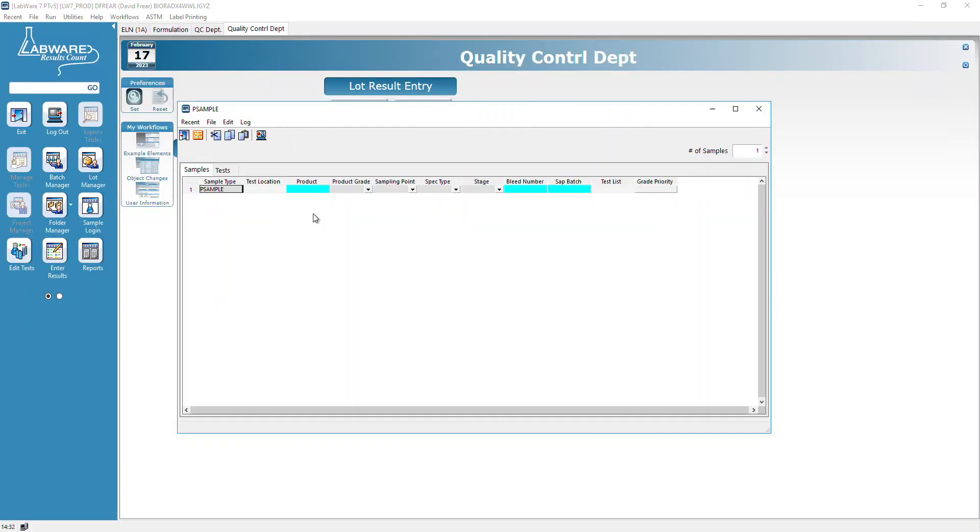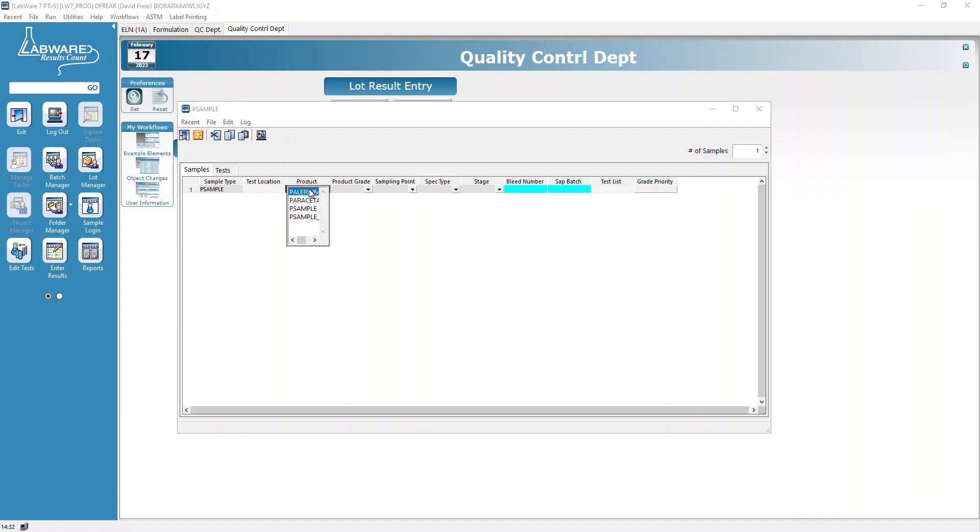That brings in your P sample templates. Now we want to put in the product number.